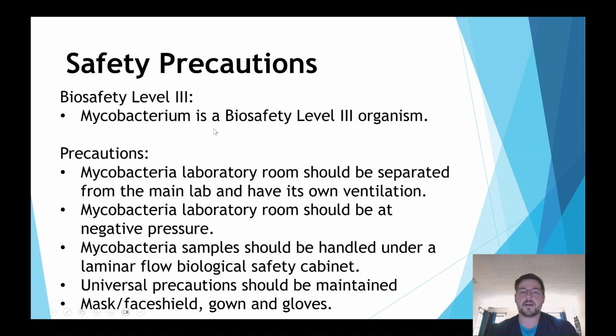Mycobacterium is a biosafety level 3 organism, which means that it can potentially cause fatal human illness and can be passed by aerosols. So there are some special safety precautions that need to be taken when handling mycobacteria in the laboratory. The mycobacteria laboratory room should be separated from the rest of the main lab and have its own ventilation.